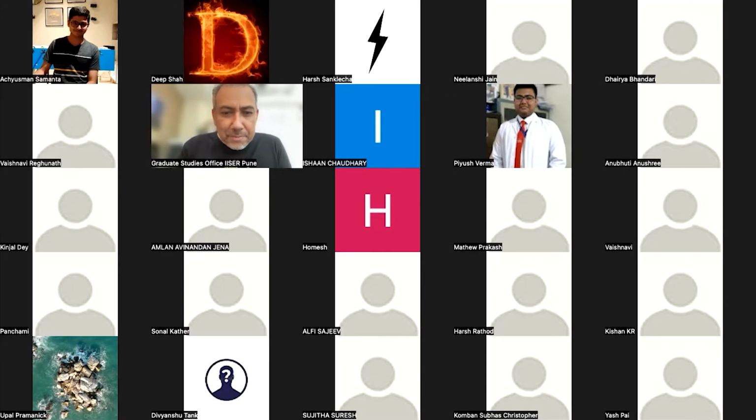Sir, I was asking about deconvolution. As you said, it makes a prediction, so are there error rates in this? Yes, of course there are. The quality of deconvolution lies in the power of the algorithm and how it calculates what it should treat as the specific image and what it should consider as background.